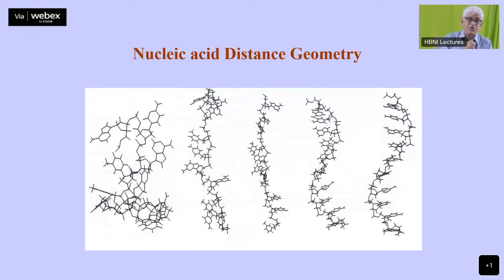Now you have this EF potential function which takes care of all the steric clashes. Then you have the NOE potential, the distance constraints. Now you optimize the torsion angles along the backbone and keep changing your model and calculating the ENOE. As you progress through the iterative procedure, eventually you will end up with a structure like this. Now it is a proper, acceptable structure, when all the conditions are satisfied.